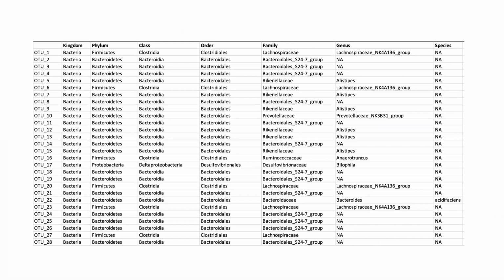In other words, those reads do not contain any kinds of contamination in terms of the sequence itself. It's also denoised because the pairs are merged. And then there's a specific emphasis on the search for chimeras. Chimeras are reads that contain a piece of one read and a piece of another read. And that might confuse our OTU assignment.